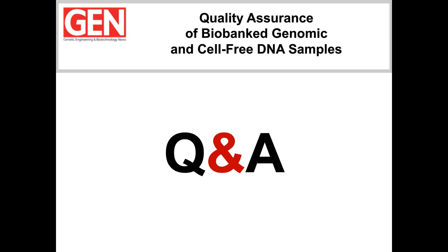Okay, great. Thank you, Faye. Rainer, another question for you. One of our audience members, I guess, missed the start a little bit and would like to know if you could discuss the difference between a bioanalyzer and screen tape technologies. Yeah, indeed, both technologies are different in quite some ways. So basically, bioanalyzer uses lab-on-a-chip technology, which is what we call microfluidics.